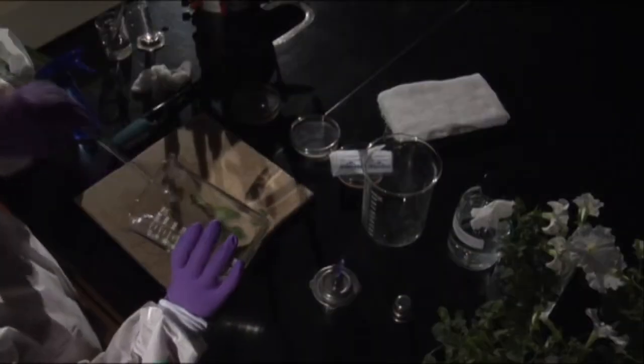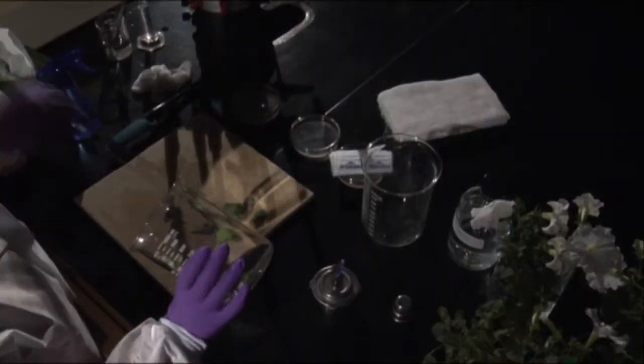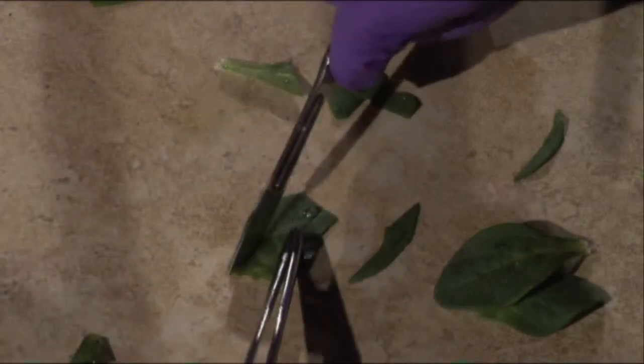Using sterile equipment, remove the leaves and place them on a tile. Cut the leaf into sections and place them in a covered petri plate.